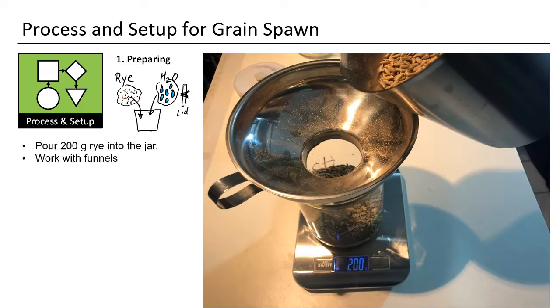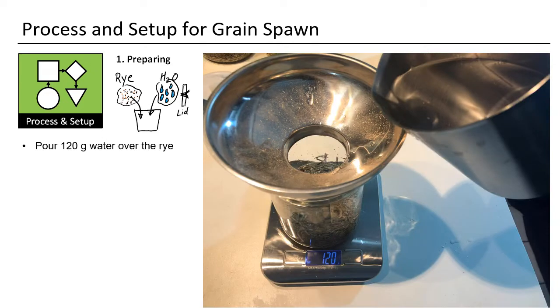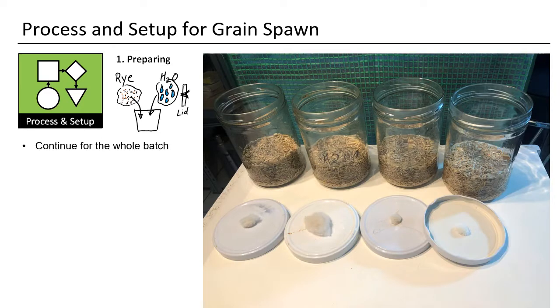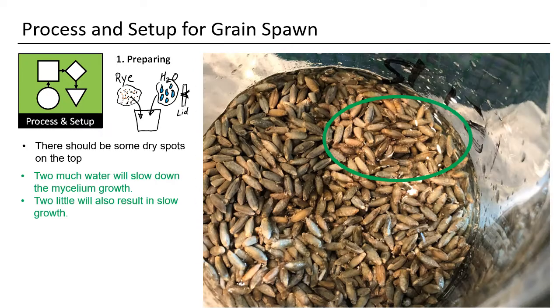Do the filling for the whole batch. Pour in 120 grams of fresh water and repeat it for each jar. The rye should not be fully covered — I always have dry spots on the top. Too much or not enough water will result in slower growth.